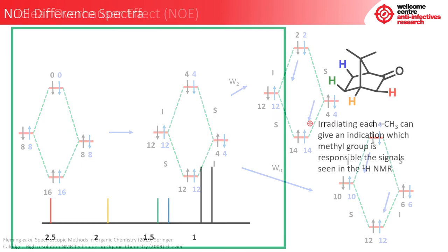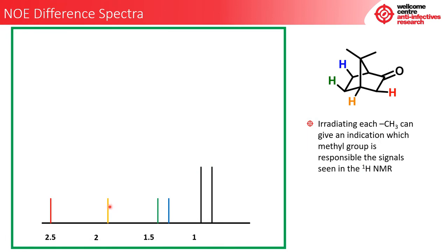So how does this actually look in spectral form? Let's take this molecule again, a slightly different reiteration from previous slides, hence the carbonyl. I'd like to outline that this is a very simplistic diagram. Everything has been denoted as a singlet, which is in theory not true. These are all CH2s, but for simplicity of the diagram, apart from this one, which is only a CH, I have given it just as a single proton that's being measured.